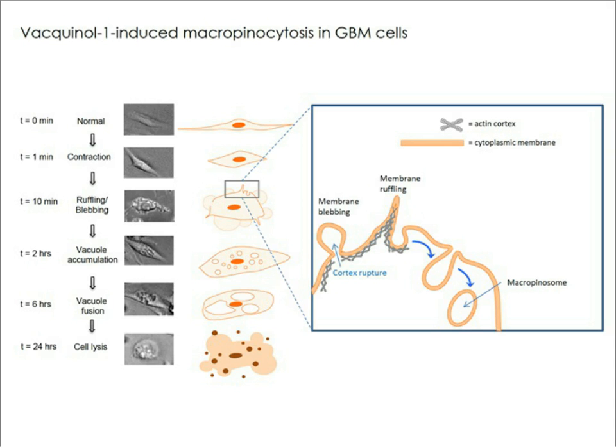It is not having time to process these vacuoles, and so it loses its attachment. It becomes round. There's a heavy loss of ATP, and then finally the cells give in and they burst. They seem to be very highly enriched.